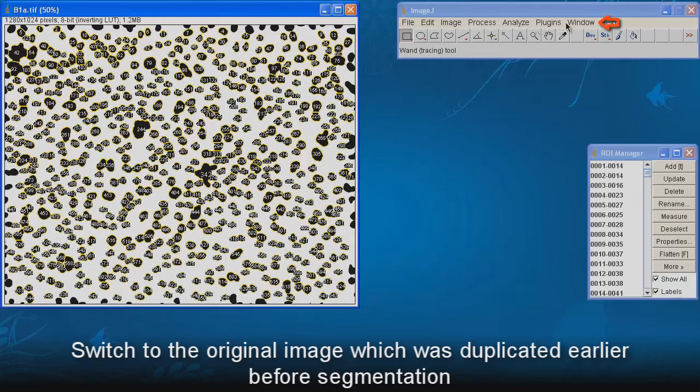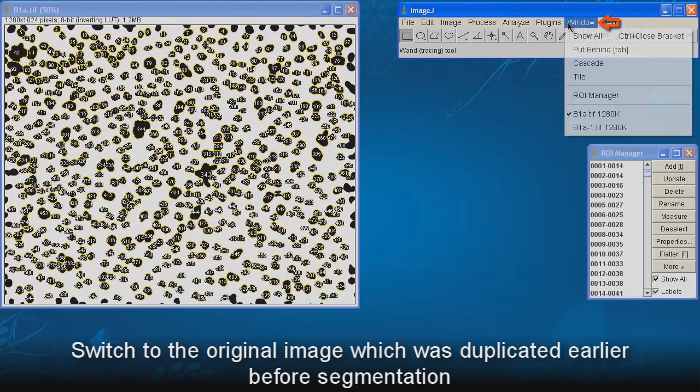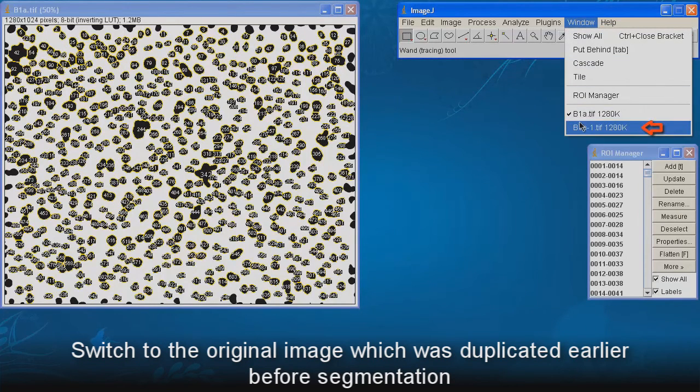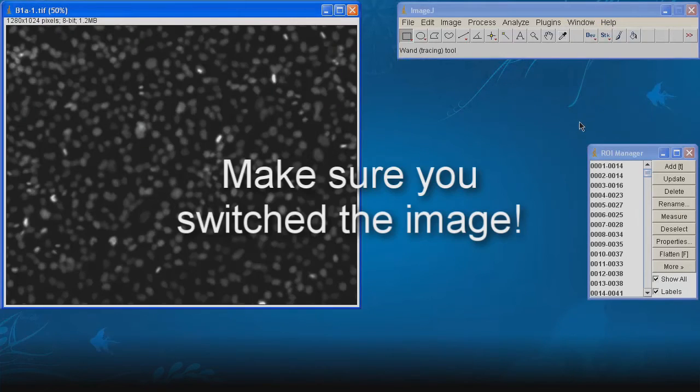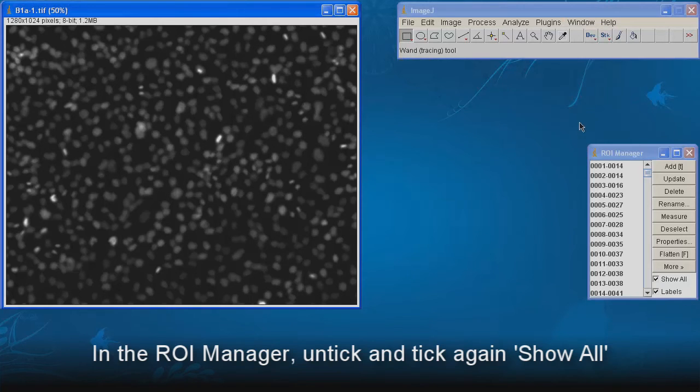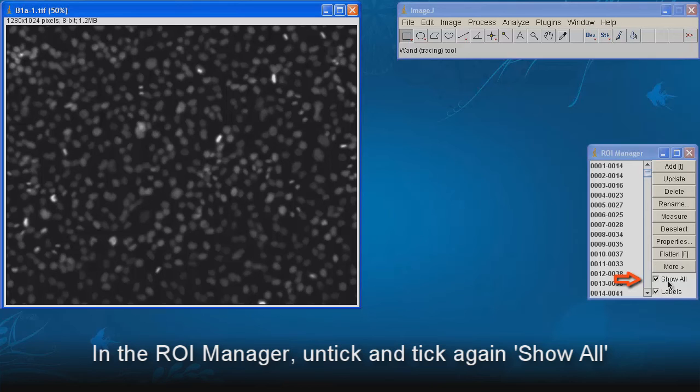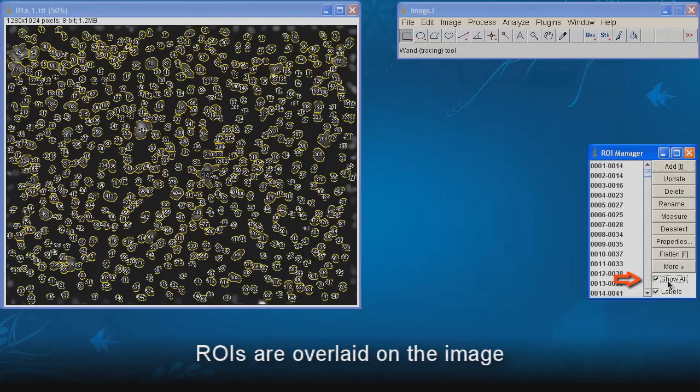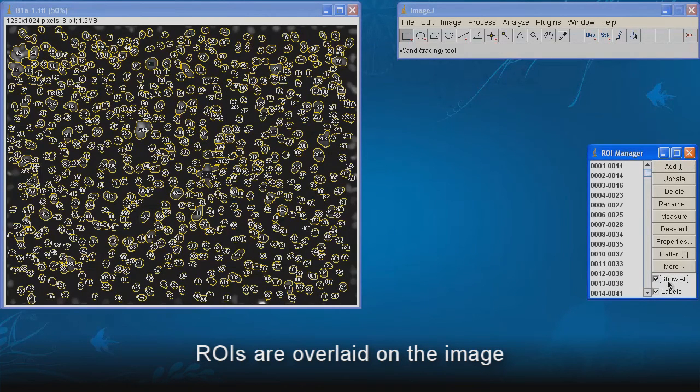Switch to the original image which was duplicated earlier before segmentation. Make sure you switch the image. In the ROI manager, untick and tick again Show All. ROIs are overlaid on the image.